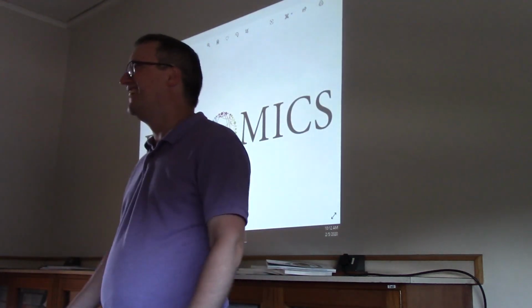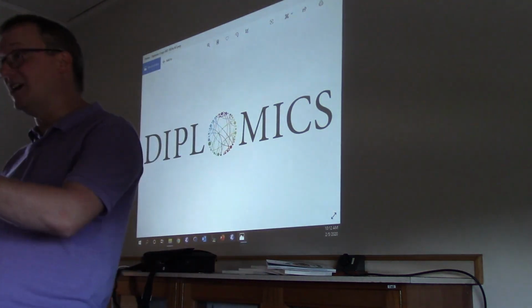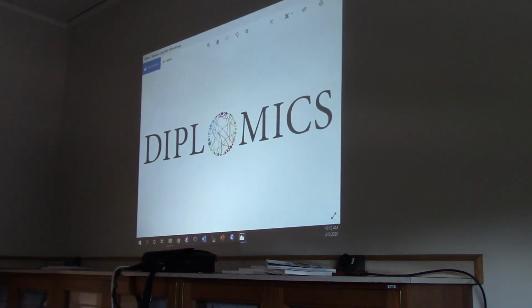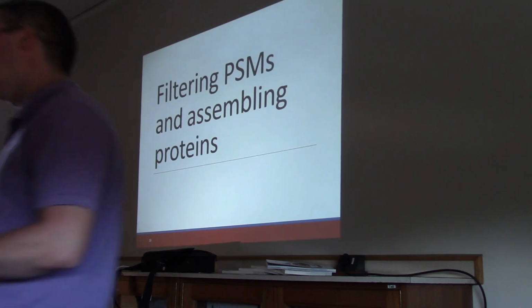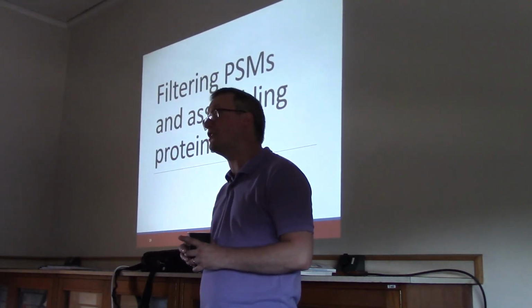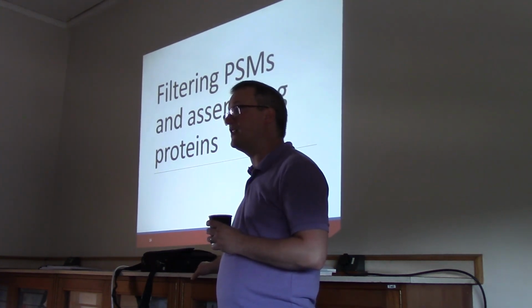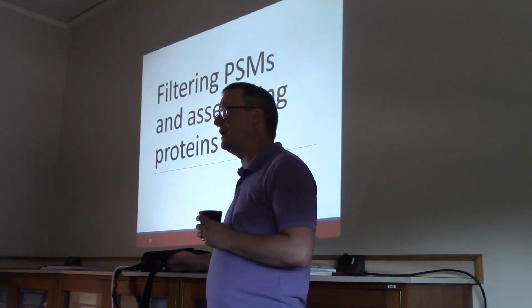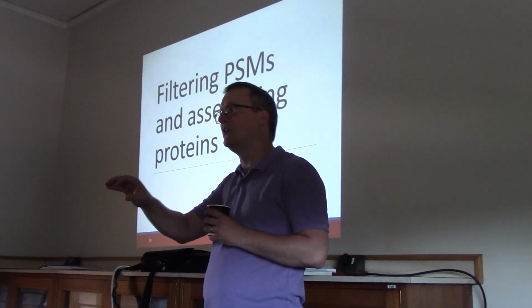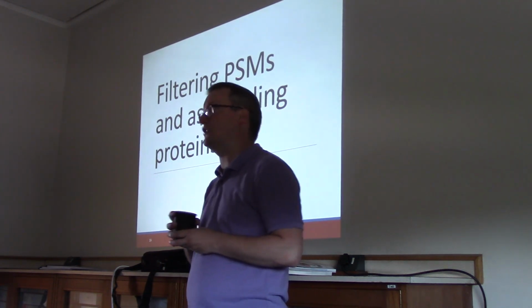And welcome back. All right, database search was very exciting indeed. But it is time for us to revisit the topic of false discovery rate, because we need to learn how to know which PSMs, which peptide spectrum matches, are trustworthy and which are not. When I use PSM a fair bit, I want you to remember that they represent a hypothesis about a tandem mass spectrum. We hypothesize that this tandem mass spectrum represents this peptide sequence. That's a peptide-spectrum match.